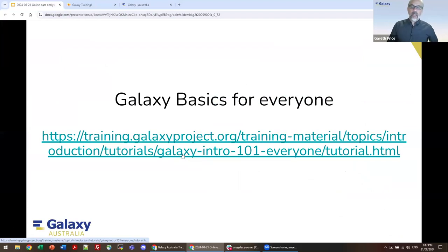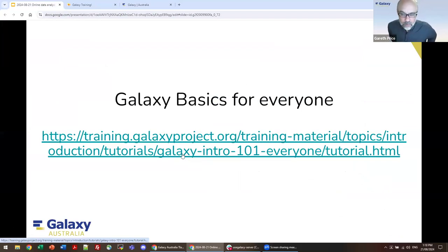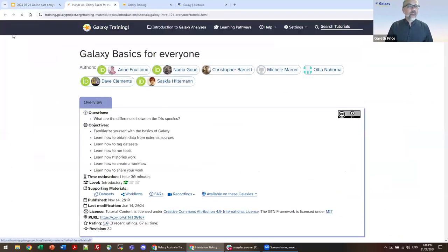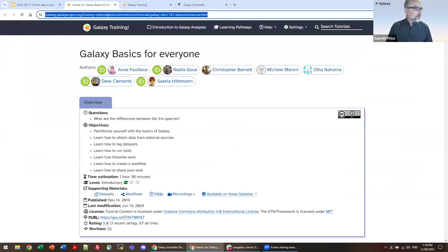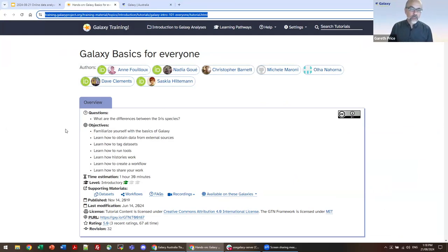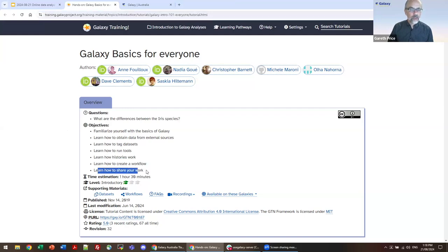The tutorial we are going to walk through has a couple of names: Galaxy Basics for Everyone, or Galaxy 101 — it's the same tutorial. We're going to walk our way through it. It's roughly split into two sections which will take us up to the Q&A and the break. We're going to familiarise ourselves with Galaxy, run some tools, build a history, and then after the break we'll do creating workflows and sharing your data.